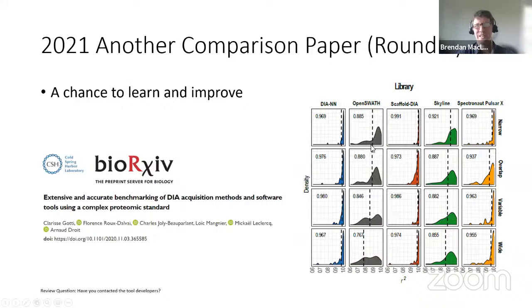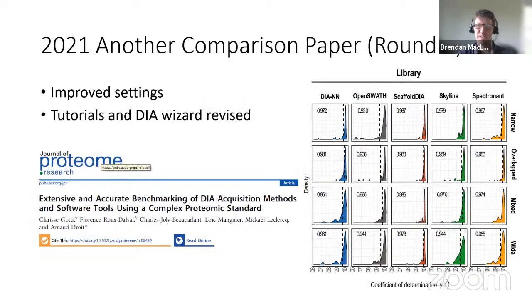And you might think, oh, it's just because they're not keeping up with these other tools. But actually, it was just settings problems. And after consulting with me, the Skyline team, and Hannes Röst on OpenSwath, the results changed to this. In fact, the authors told me in the end they felt that the quantitative results of Skyline were really the best, though the numbers may differ for some of them. I used Skyline Batch for this as well, and this is a large scale DIA study.